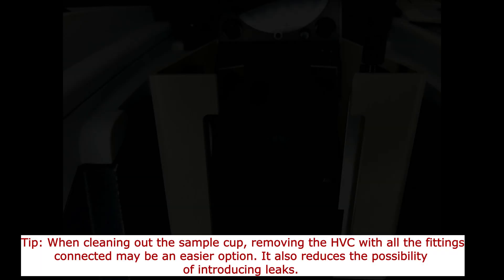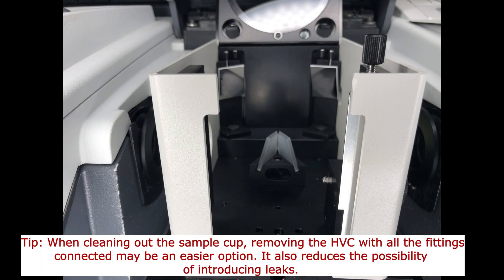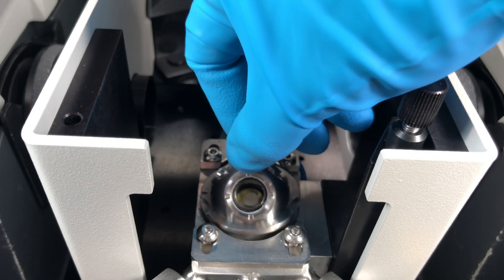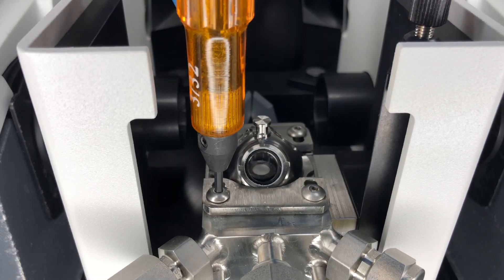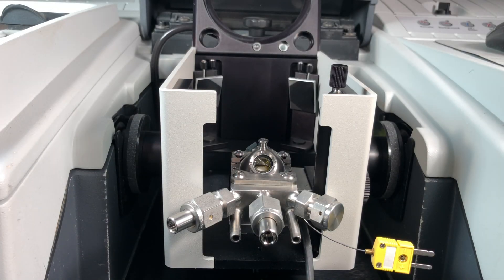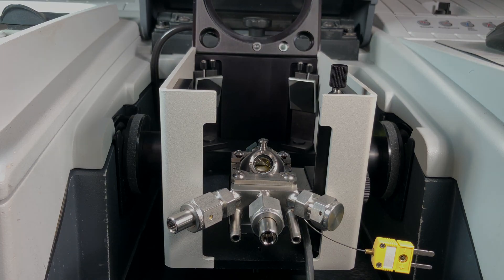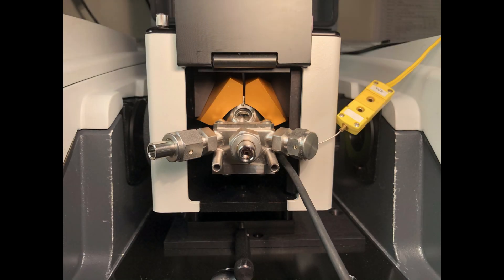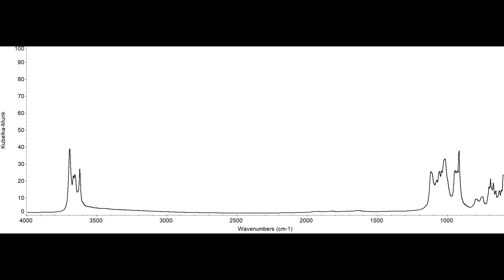Remove the dome and empty the sample cup. If needed, clean the sample cup, then fill it with the sample. Install the dome and reinstall the HVC into the Praying Mantis if it was removed to empty the sample cup. Swing the top plate back into place and tighten the thumb screw. Restore the desired sampling conditions and collect the sample spectrum. Empty the sample cup and clean it before running the next sample.